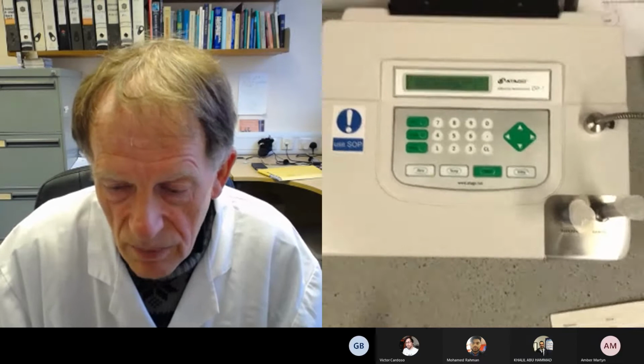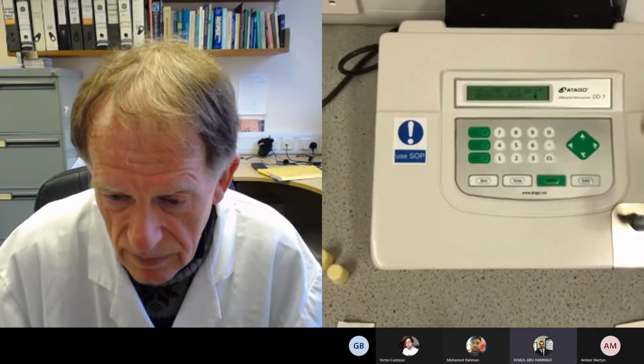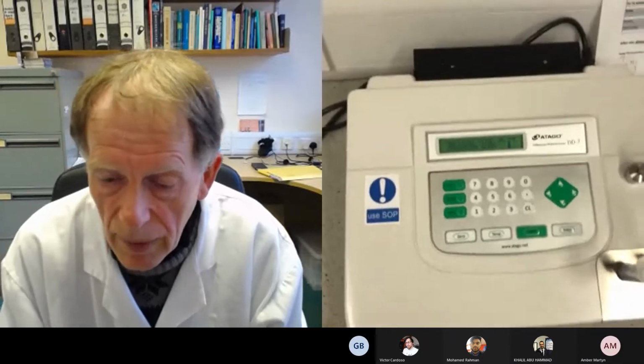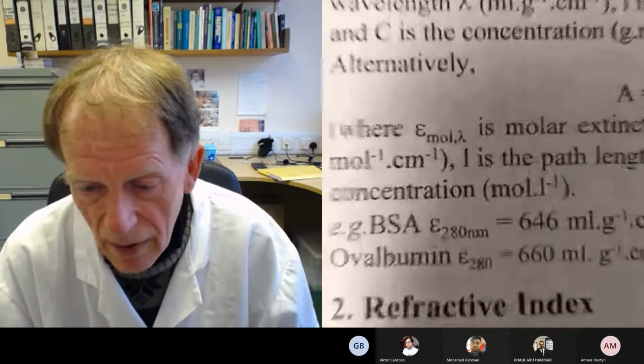But what's the main advantage of using a refractometer for measuring concentrations of molecules? Or we can use it for the absorbance more than 1.5. Yeah, we can look at higher concentrations, sure. But you mentioned absorbance there, Khalil. We don't actually measure absorbance with the refractometer. We measure the refractive index properties.